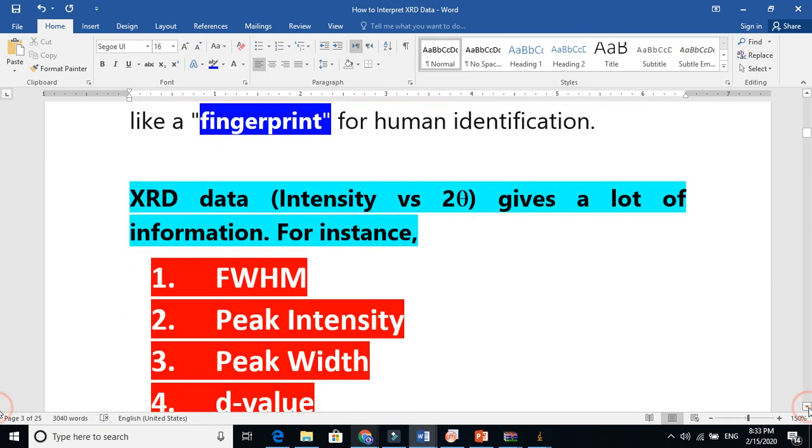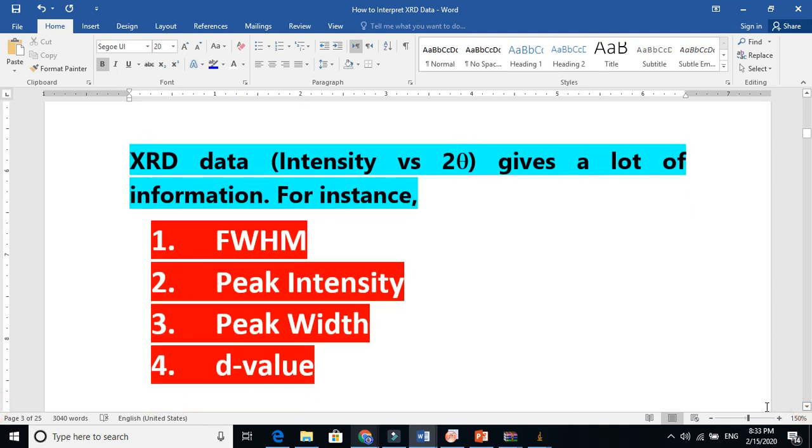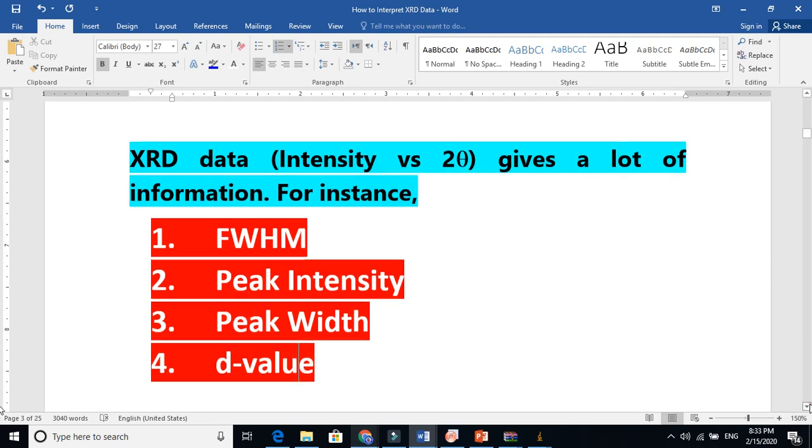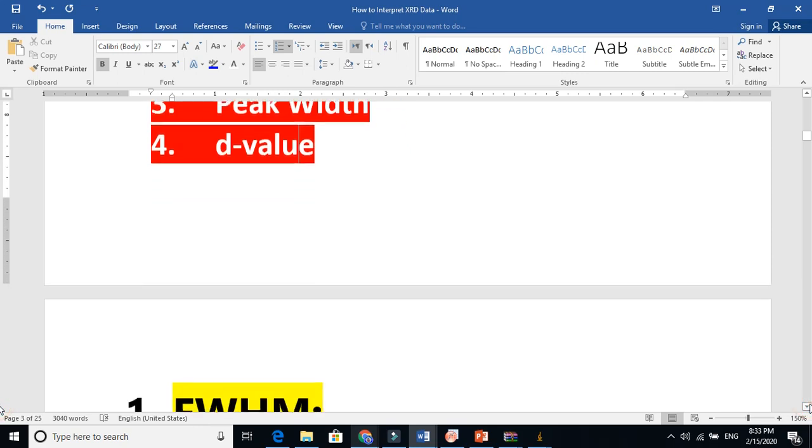XRD data is basically intensity versus 2 theta. It gives a lot of information. For instance, you must need to know what is full width at half maxima, what is the peak intensity. Why the peak intensity is higher in one case, why it is lower. Why would one plane have more peak intensity while the other plane has less. Peak width and the d-value. I will explain these things step by step in very good detail.